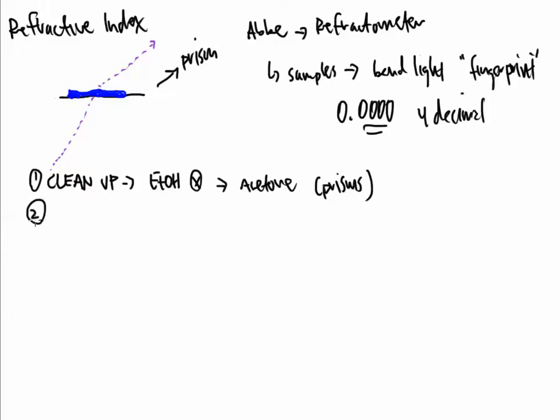Next, something else that we want to talk about is the purpose of the chem wipe. Now, for some of you, you've maybe never used a chem wipe before. Think of these as eyeglass towels, right? So most of the time you spray some kind of special cleaner on the lenses of your glasses, and some of you will buy those really thin, non-abrasive wipes to wipe the front and the backs off. That's kind of like a chem wipe. We use chem wipes whenever we want to clean something that's very fragile as far as glassware is concerned, especially in the laboratory.